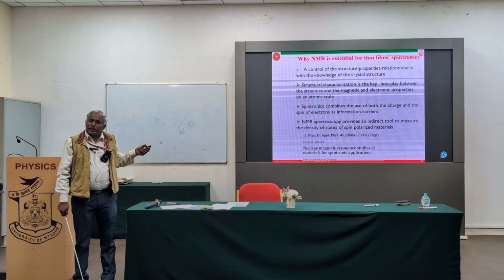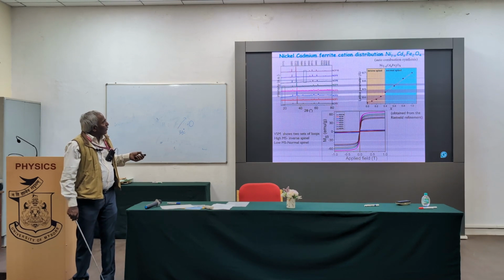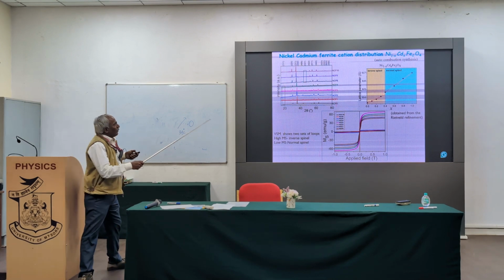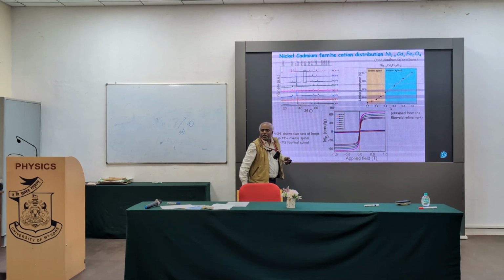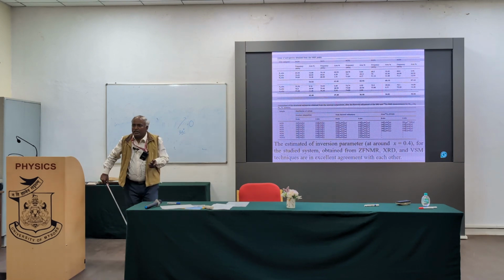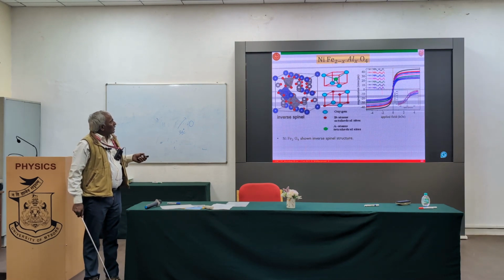One is regular work we can do. If you do not have facilities for that, we can build our own spectrometer and study here. In the same cadmium system I told you about, when it becomes a normal spinel system versus an inverse spinel system can also be estimated by measuring the lattice parameter with XRD. That can be correlated with the NMR. These are finer details of the exact composition that can be measured, and these are additional work.